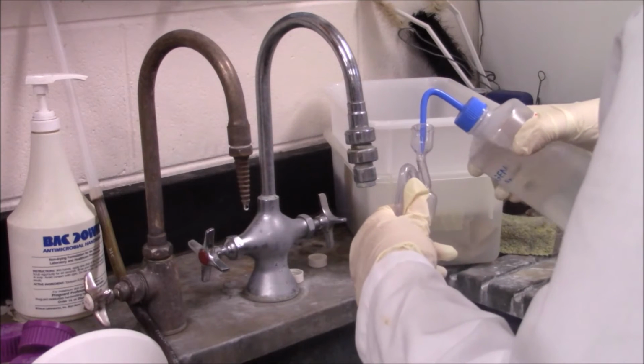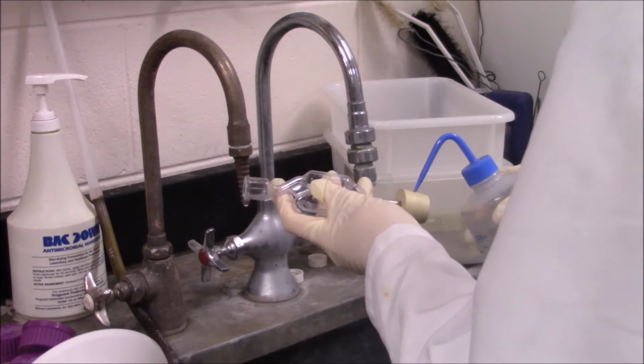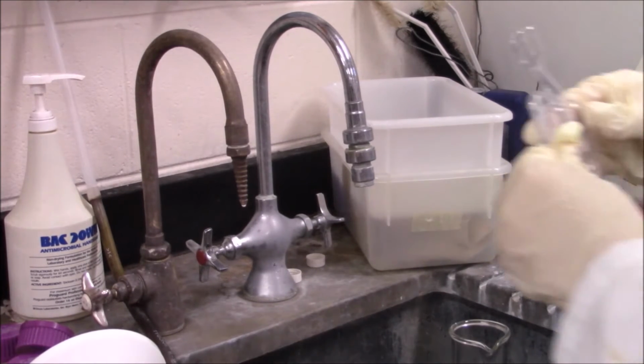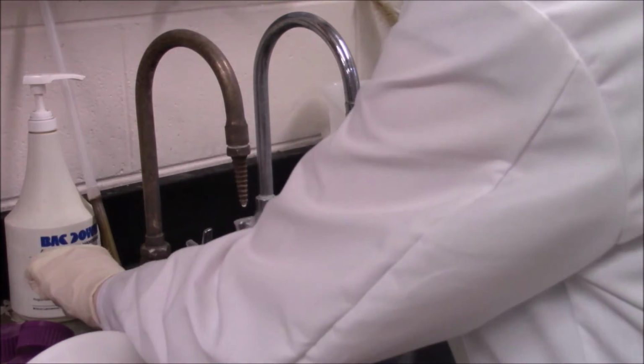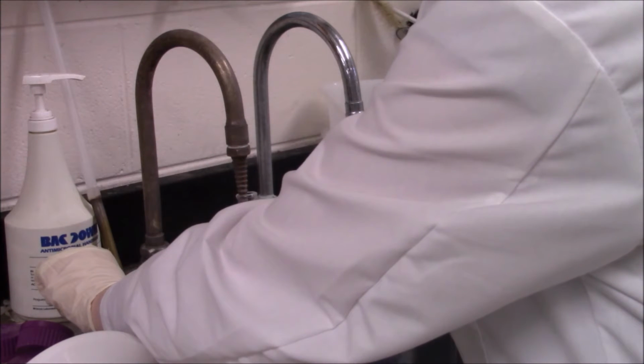Sterilize the airlock and rubber stopper with a squirt bottle of 70% ethanol. Spray all inside surfaces and allow to dry. Fill the airlock to the max line with distilled water. Insert the assembly into the 250 milliliter flask containing pre-treated wood chips, enzymes, and yeast.